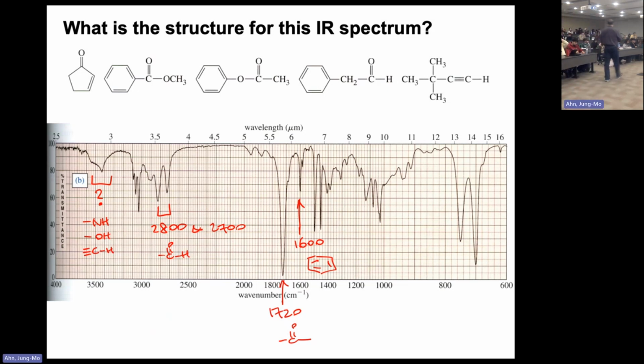I mean, that's an amine signal. It could be as small as that. I mean, it could be big, just like what we saw before, but it could be as small as that. So that signal is leading you to think that the molecule may have an amine there, but none of these molecules has an amine. So how would that happen? Why are these signals showing up?